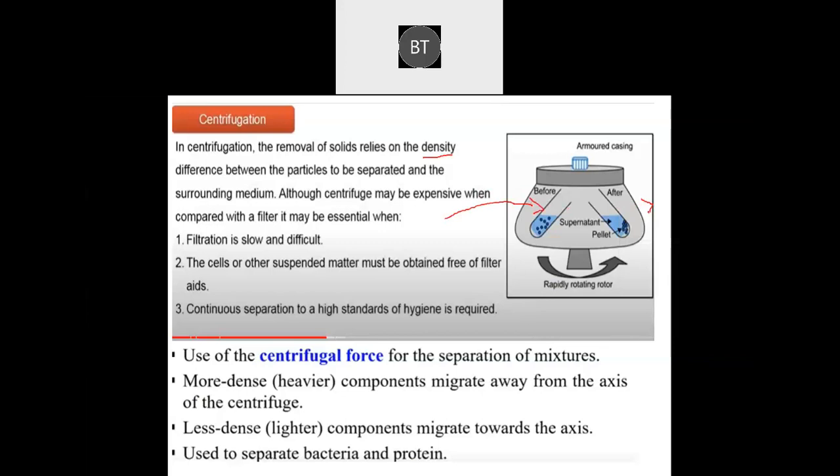There are also different types of centrifugation, which we are not going to go into detail. One drawback of centrifugation is that it is expensive, but it is one of the best methods. Since industrial centrifugation has been developed, the entire process is becoming easy because there is continuous feeding of your slurry and collection of the clarified fluid.